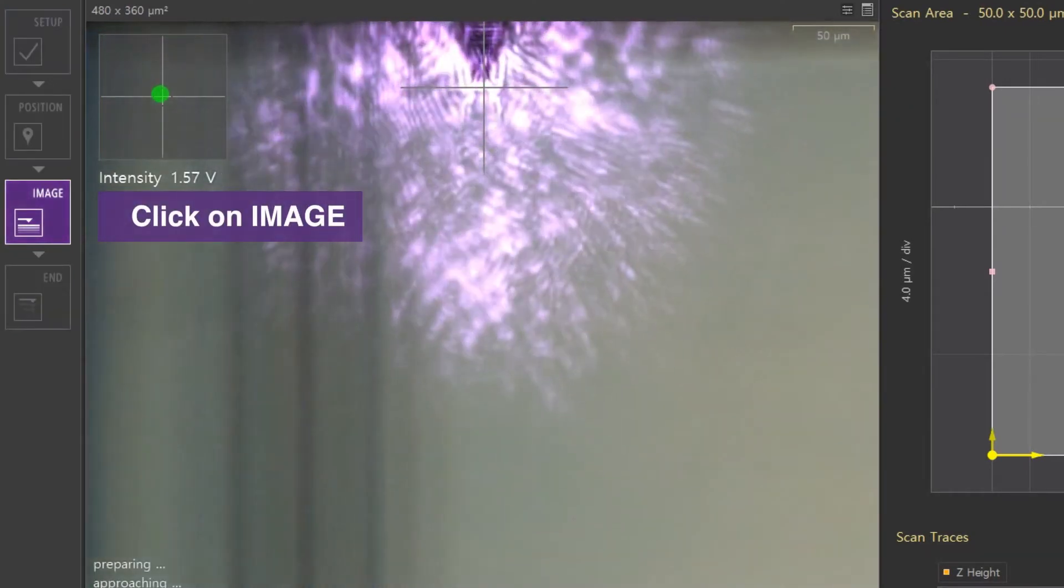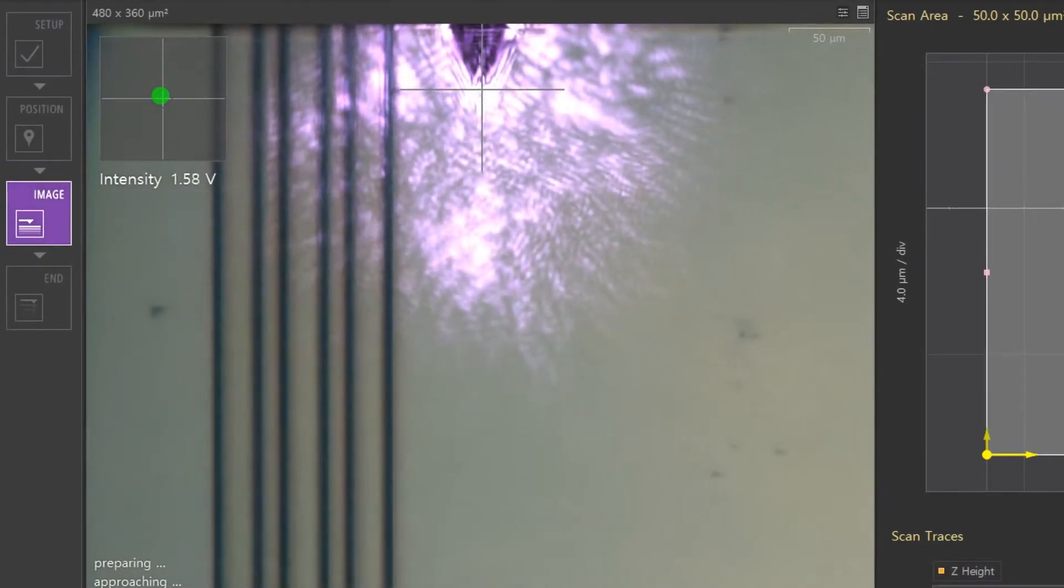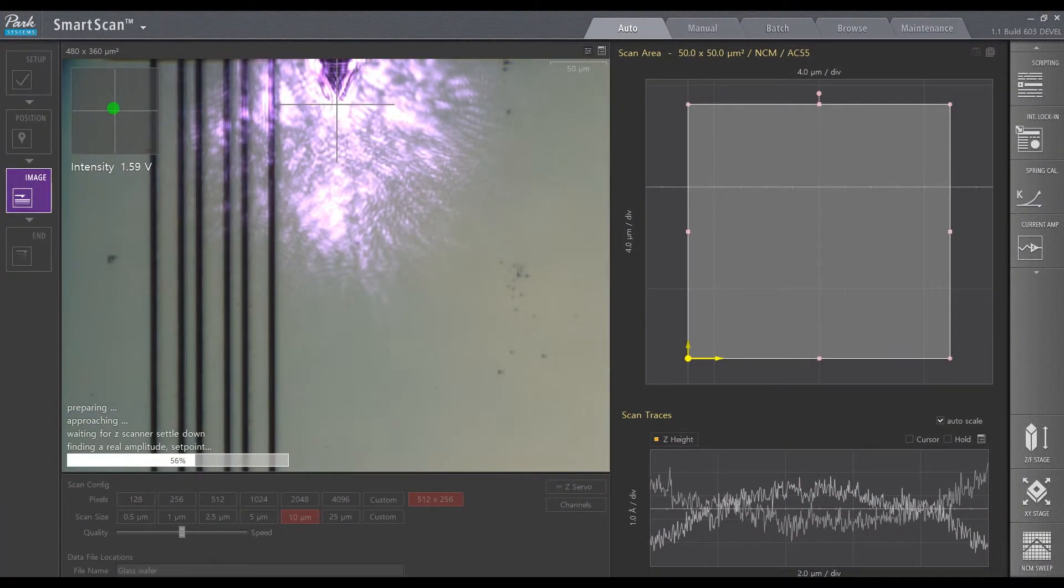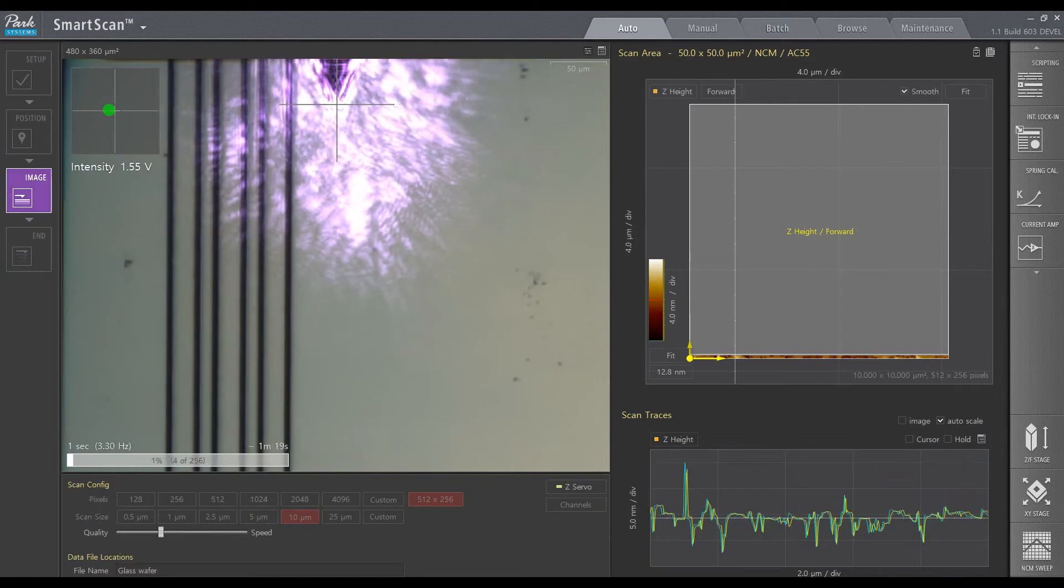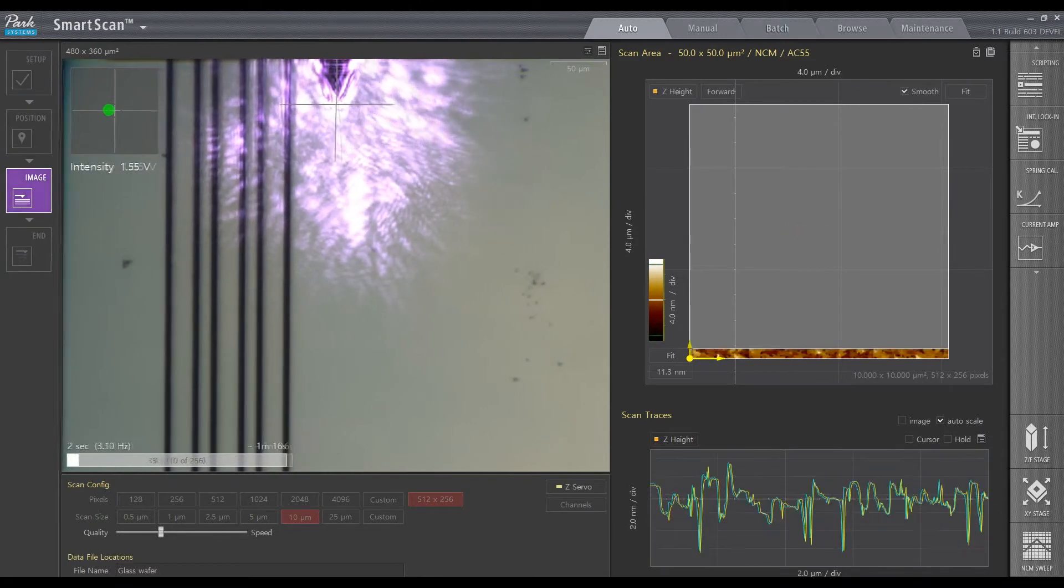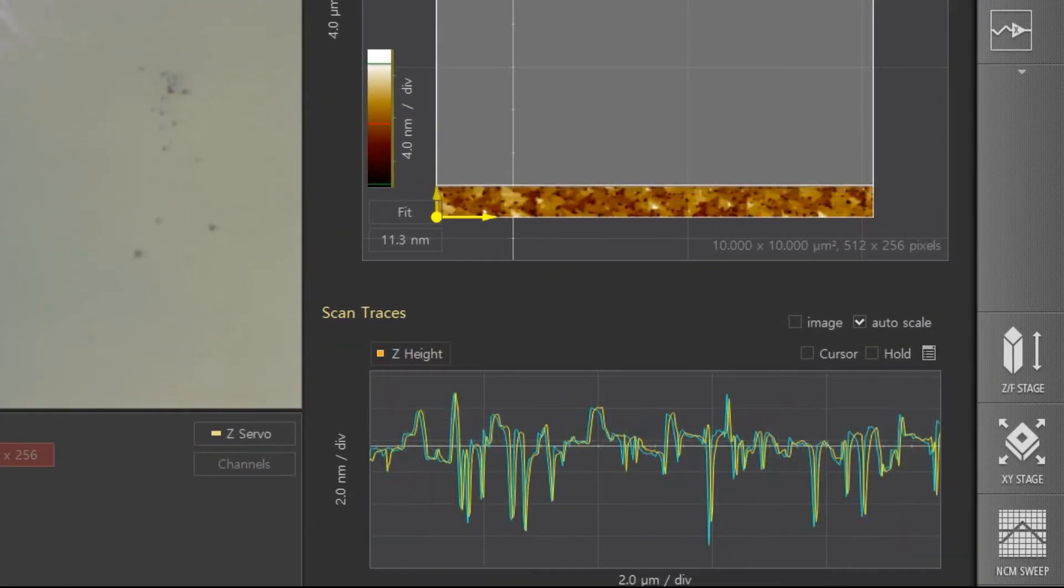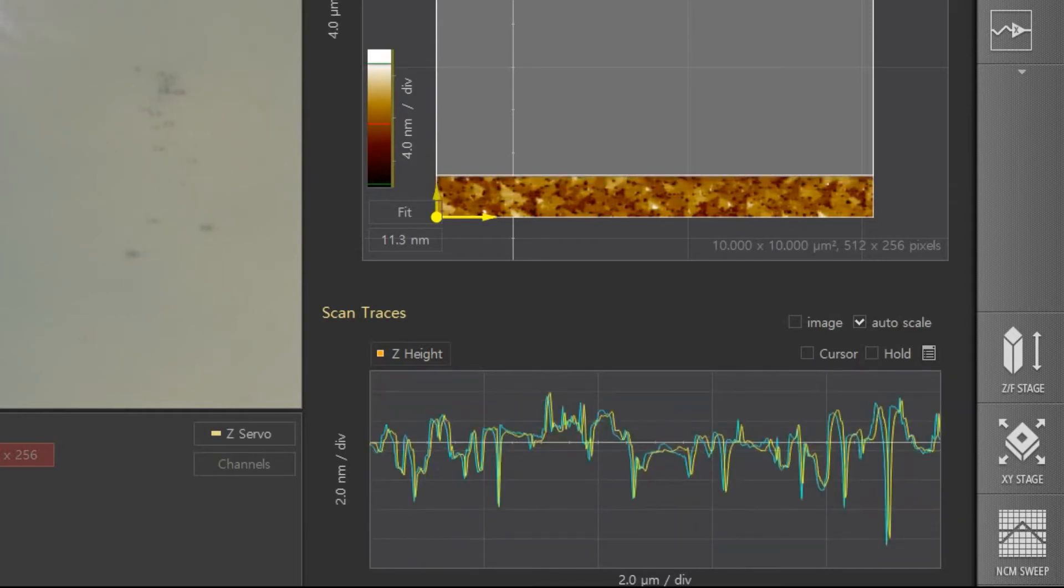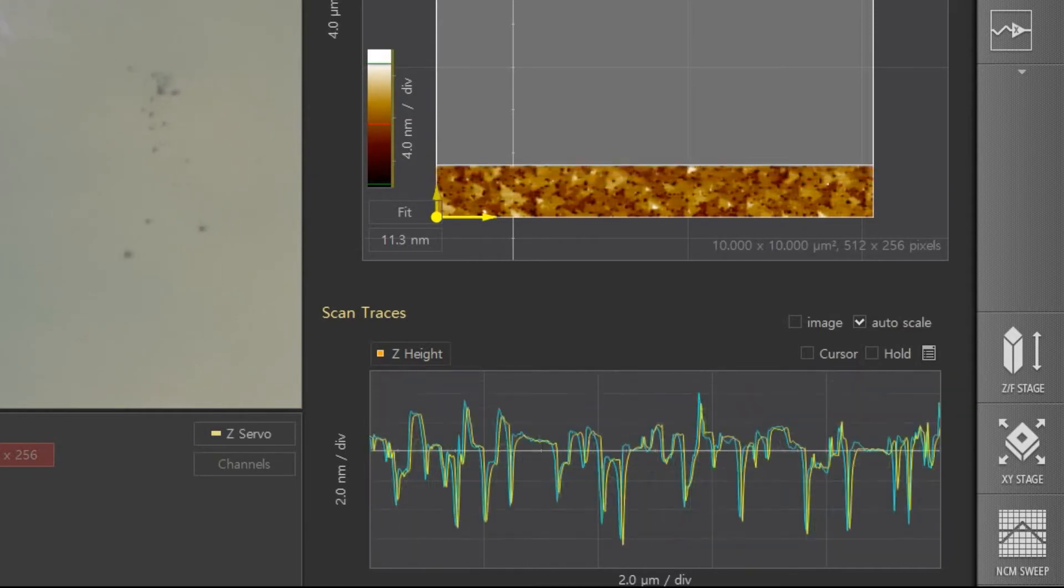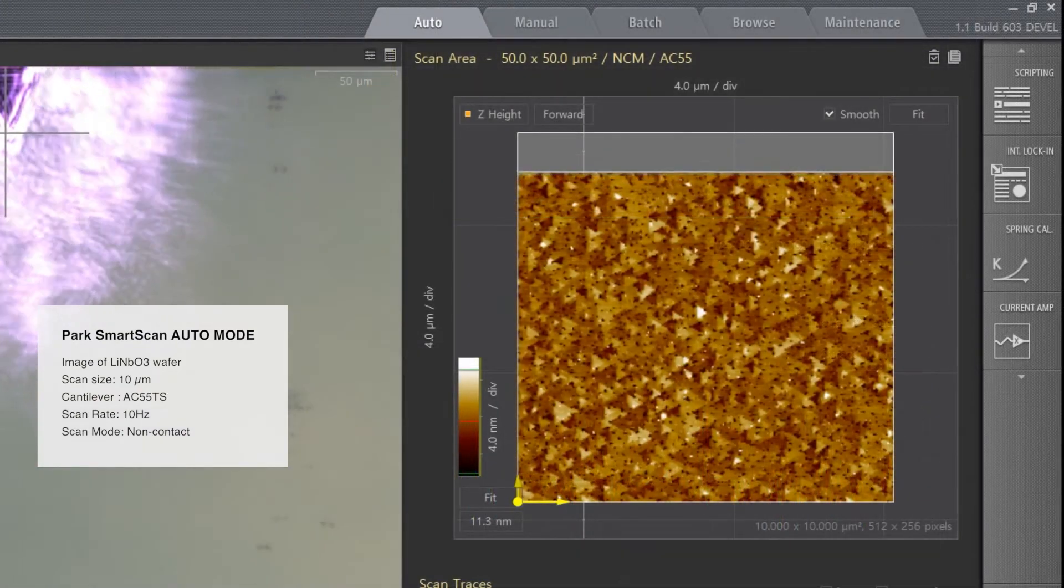Returning to the scan, again, a 10 Hz scan speed rapidly produces accurate images which show the characteristic triangular shape of these patterns. Despite the fast scan speed, the trace and retrace line profiles match well, and provide reassurance that correct, accurate data is being obtained.